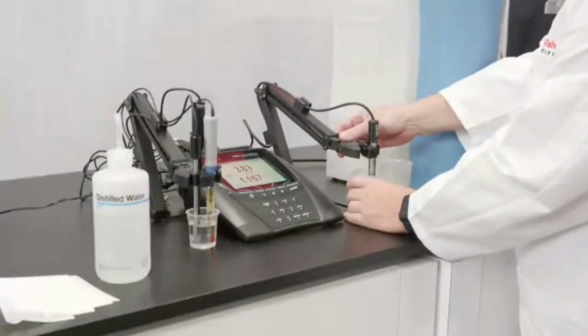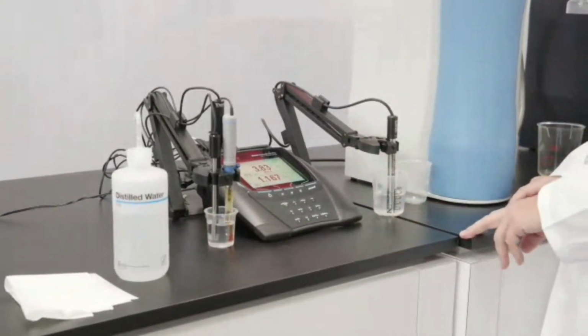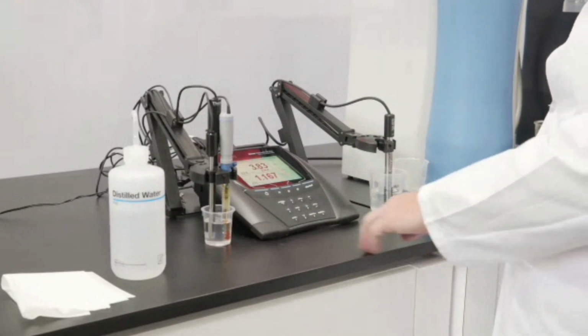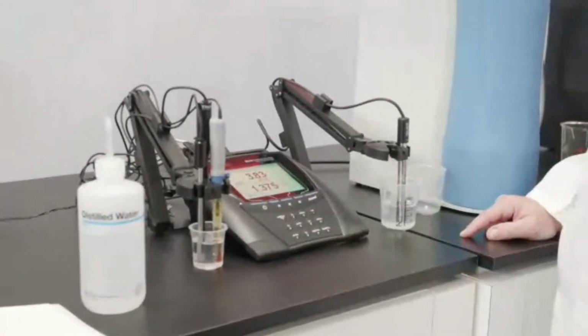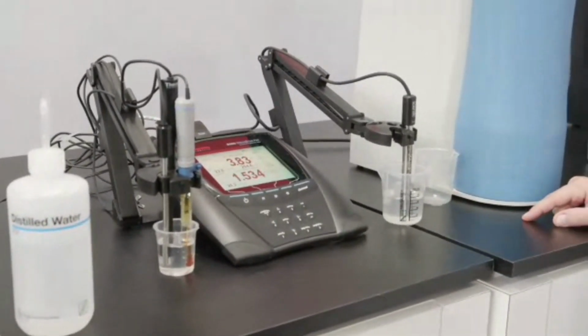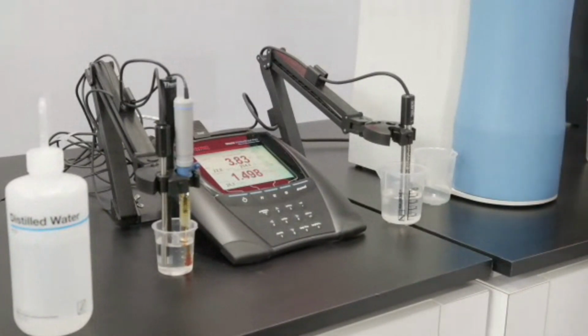First, we'll measure conductivity. Again, ultrapure water at 18.2 megaohms is 0.055 microsiemens per centimeter. Just that little bit of time from taking the aliquot out of the system and bringing it over and measuring shows a conductivity of almost 1.5 microsiemens, right? Which would correspond to a little bit less than 1 megaohm.